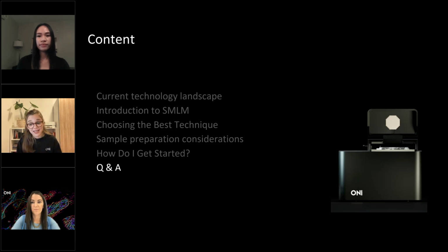I also have to say it is quite a challenging endeavor, so don't be frustrated. DNA-PAINT with more than 3 colors is definitely a very advanced research question. So you'd always recommend, yes, to start with few and then build up.